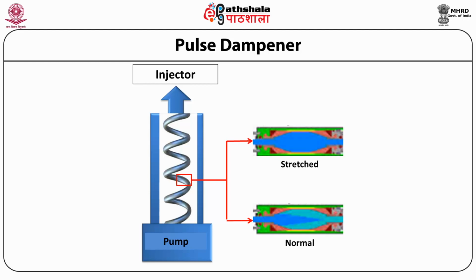When the pulsating flow is encountered by the dampener, the pressure rises in the tube and the tube is stretched. Due to stretching, the volume of tube increases, which adjusts the excess mobile phase, thus lowering down the pulsation. The tubular coil flexes on each stroke of pump and absorbs the pulsation energy. As the pressure decreases, the volume of tube also decreases. Whole system works as a hydraulic accumulator and shock absorber, smoothing out the pulses in the mobile phase flow.